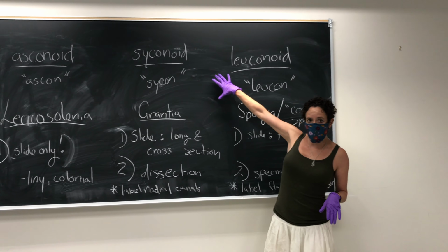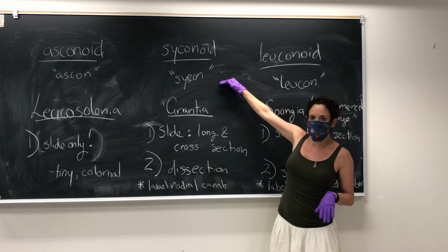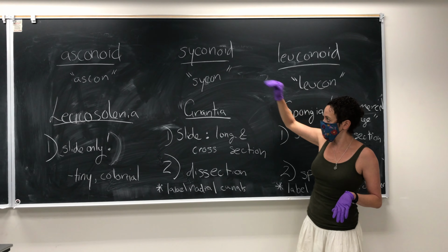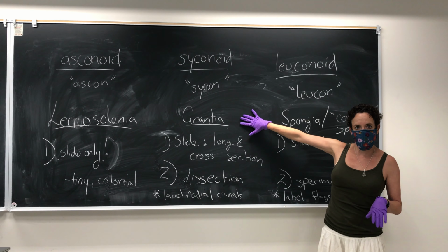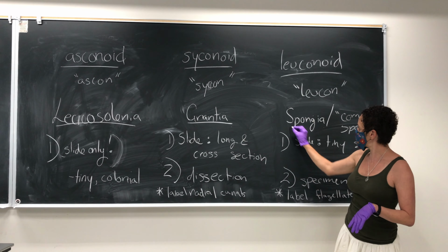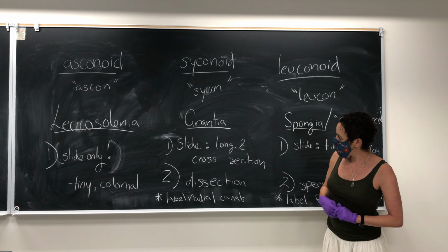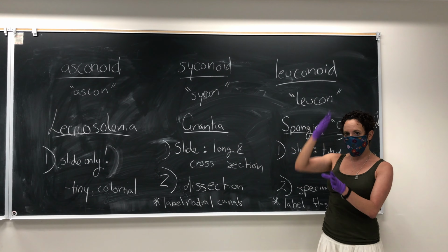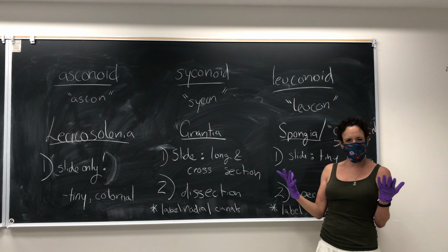For the syconoid body plan, you actually have multiple specimens. Again, the lab atlas calls it the Sycon plan. The main organism to look at is Grantia. These are all genera names, so you would italicize them or underline them. You have a slide that has a long and a cross section on it, and it's stained kind of in purple.